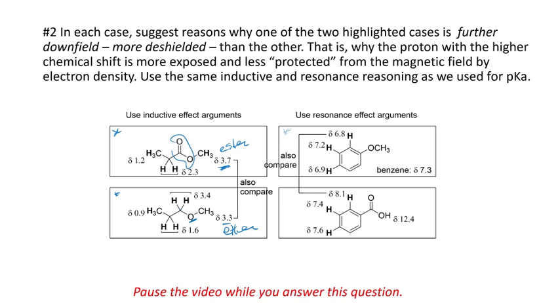All right, now what about these two on the right? Well, these are aromatic systems, and they're very dramatically different. It has to do with the oxygen being able to donate a pair of its electrons to the ring, dumping electron density into the ring, and shielding whatever hydrogens are there. So that's why all of our hydrogens are at shielded positions relative to benzene, which is just a 6-membered ring, 3 double bonds, and all hydrogens. Nothing on it. Got 7.3. They're all shielded by the OCH3.